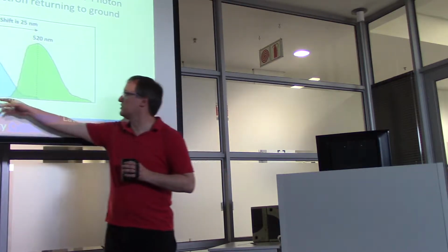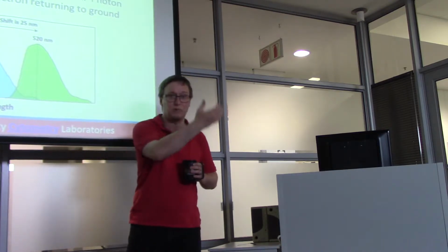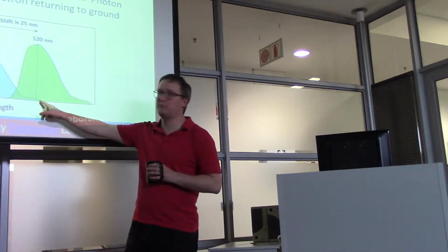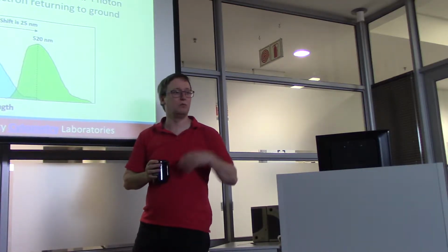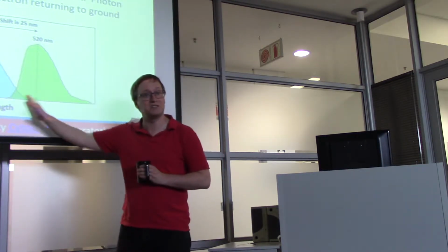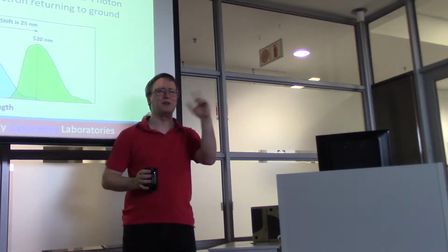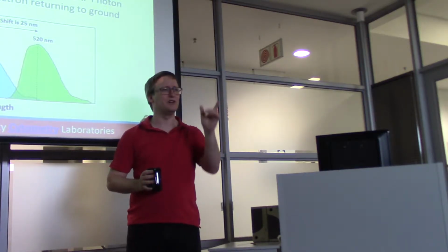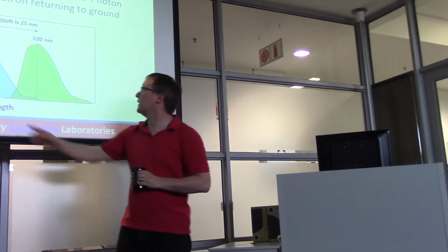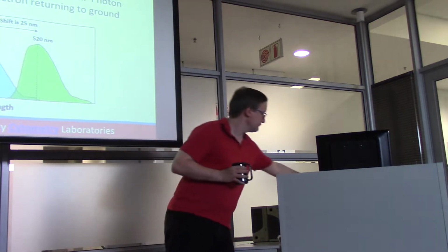Lower. So there's a little bit of inefficiency involved in this lighting process and the emission process. We put in more energetic light and receive back a less energetic light, one photon in, one photon out sort of thing. That difference between these two frequencies is called the Stokes shift. I'm sorry, I talk about frequencies and wavelengths kind of interchangeably, but remember that one has an inverse relationship to the other. As we go to a higher wavelength, we go to a lower frequency. Okay.